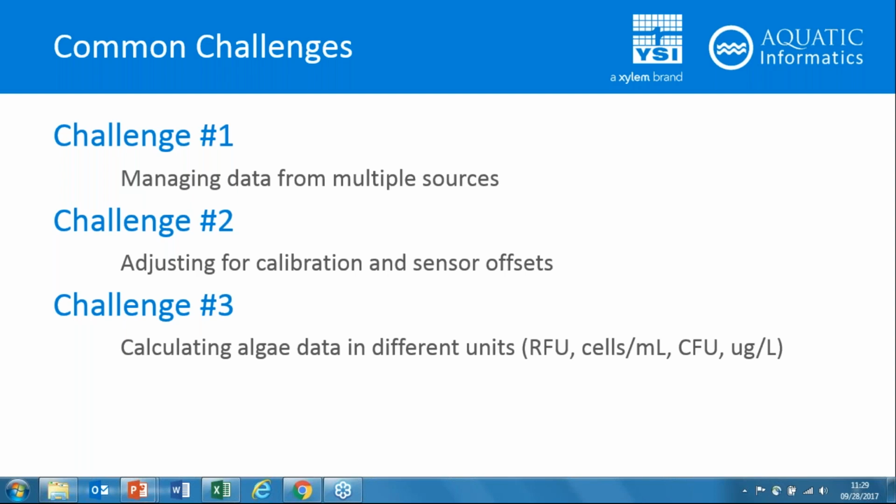So our challenges that we'll be looking at today are, first off, managing data from multiple sources. As Stephanie mentioned, we've got continuous sensor data from our sondes and lots of parameters that we're collecting. We've got samples that we're sending off to the lab and we're getting those results back. We've got field data, cleaning regimens and calibration regimens of the sonde sensors themselves, and getting all of this data matched up and lined up and put together can be a bit of a challenge.